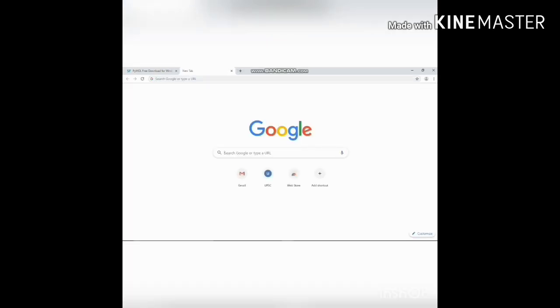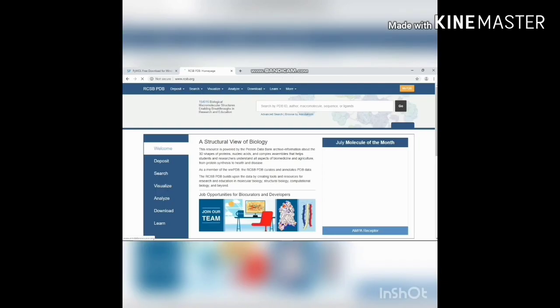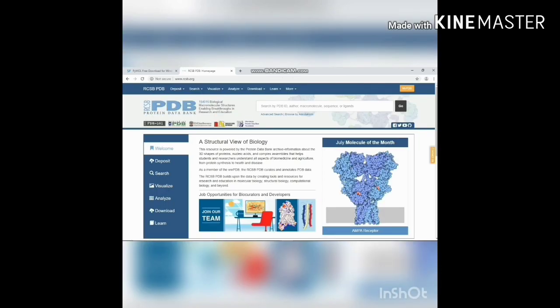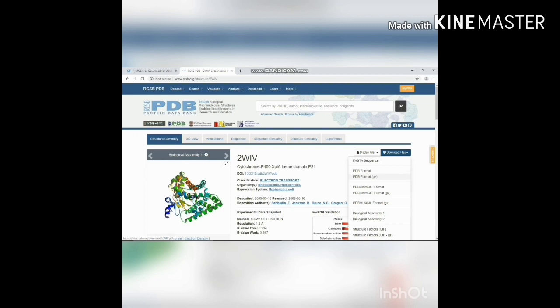Then you will download your protein structure using PDB. Type PDB and click the RCSB PDB homepage. It contains 150,000 entries, so you can easily retrieve any kind of protein molecule. In the search option you can give any protein — for example, this is the cytochrome P450 enzyme. Click that structure, then click the download option and download in PDB format. The structure will be automatically downloaded.